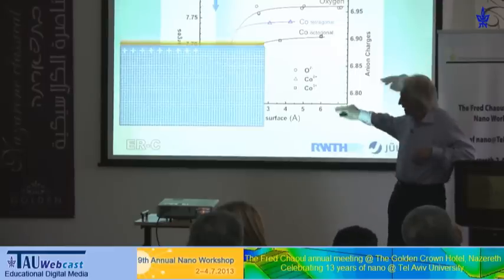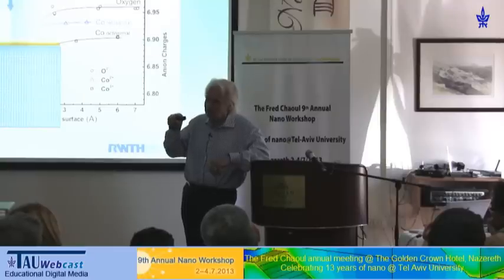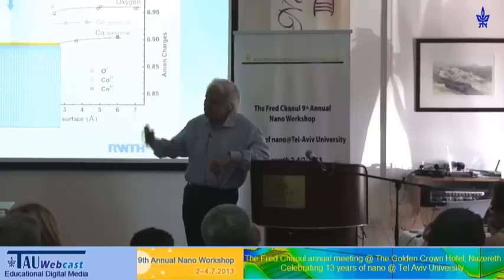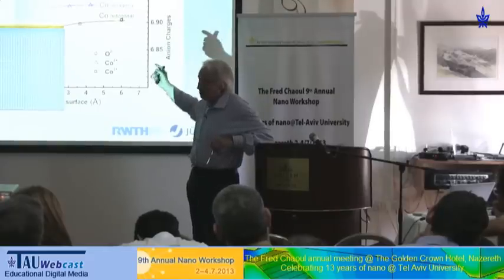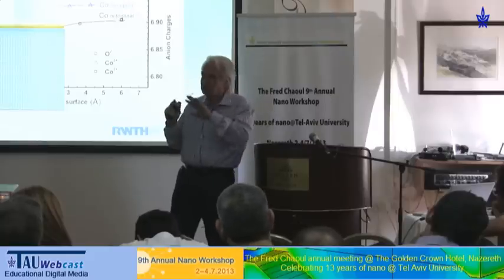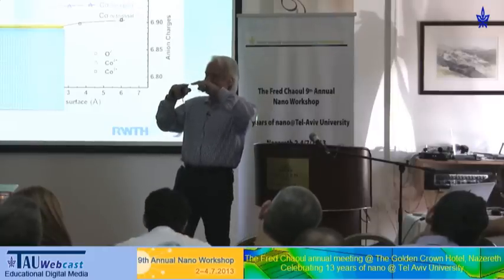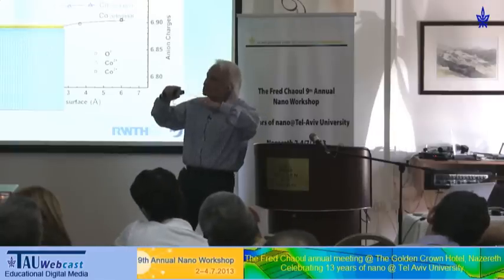But I couldn't say everything here, because when you replace 4-valent titanium with 3-valent aluminum, you just get a charge compensation effect. So that means it's going into the wrong direction. In addition, I couldn't show this tetrahedron motion in the upper part of my figure here. We also found what nobody else has found before, that the oxygen in the first layers around the lanthanum aluminate layer, they are relaxing towards the interface.